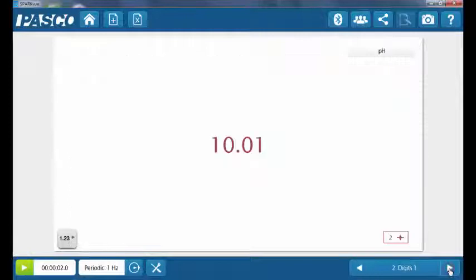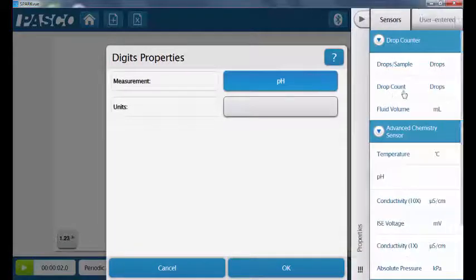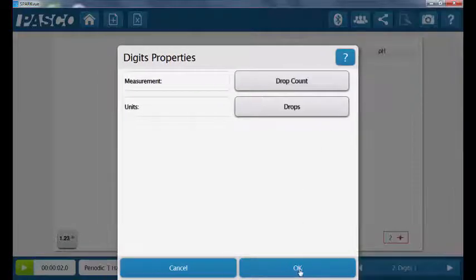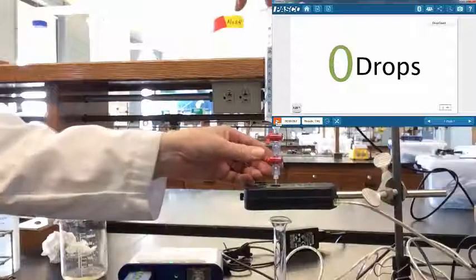Go to the digit screen in the SparkView software. If necessary, click on the measurement and change the measurement type to drop count. Press the record button so that the software will begin recording drops as soon as you open the bottom stop cock.